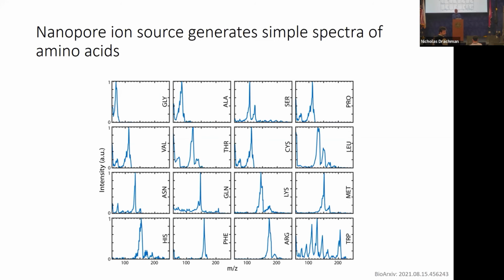So that's a brilliant idea. If you can make the ionization efficiency higher than 1%, it would be a dramatic improvement. But one of the main functions of an ion source is generally to get rid of the neutrals. A lot of times you've got neutrals that are not ionized and they cause ion suppression. So you lose a lot of your ions. We can just put them in the category of matrix components and things that are just not ionized, and they'll knock off a lot of the ions.